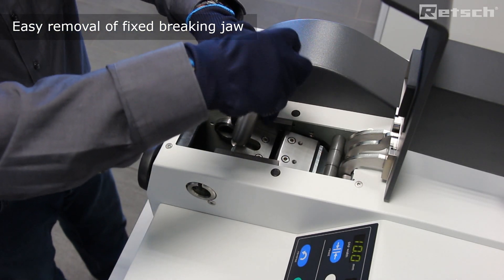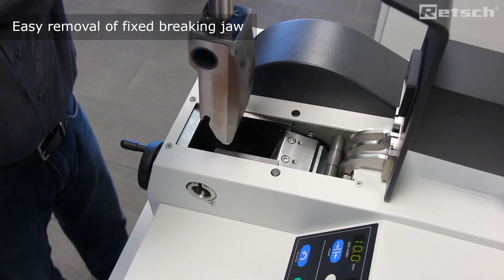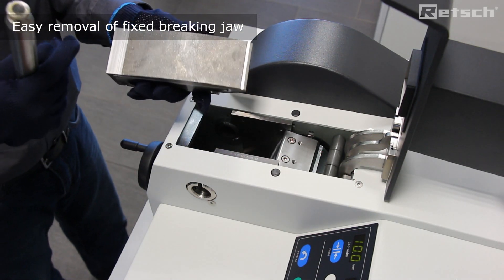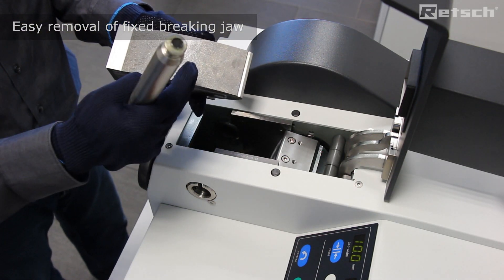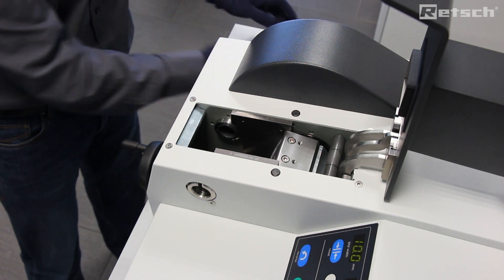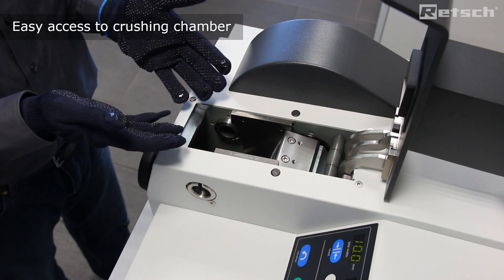We offer a simple solution with the tool provided to remove the breaking jaw as easily as this. Therefore we can very easily clean the fixed breaking jaw, and now we have access to the crushing chamber for more thorough cleaning.